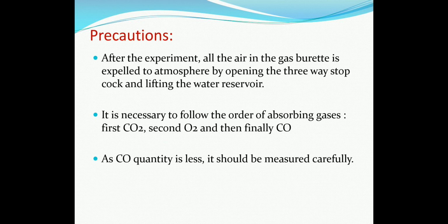Finally, let us go to the precautions. Here, while doing the experiment, it is necessary to follow the order of absorbing gases. First carbon dioxide, second oxygen, and then finally carbon monoxide. As carbon monoxide quantity is less, it should be measured carefully.